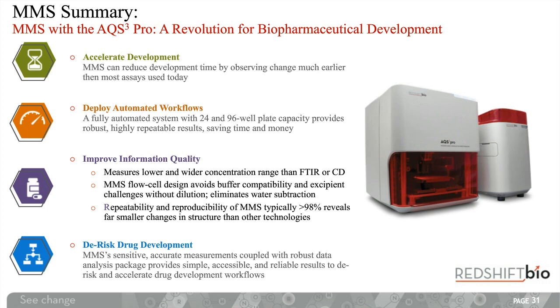We could compare it numerically with the similarity analysis, giving us a percentage score comparing the reference to each one of those samples. We could also look at the secondary structure outputs in a bar chart to very clearly see, particularly with the disordered spectra, that those which show a smaller amount of the disordered structure were clearly the candidates most similar to the reference.